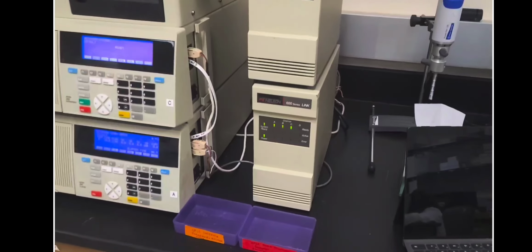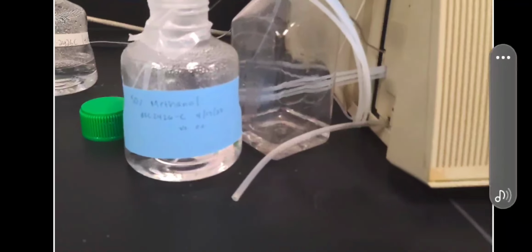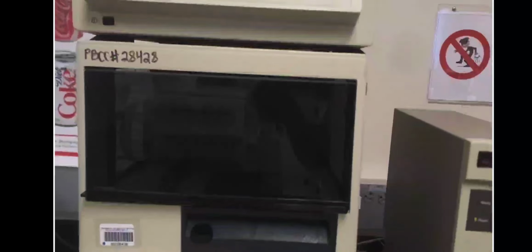High-performance liquid chromatography, or high-pressure liquid chromatography, is one of the techniques in the family of liquid chromatography. Other liquid chromatography techniques include fast protein liquid chromatography, thin layer chromatography, and regular column liquid chromatography that uses gravity to push the mobile phase.